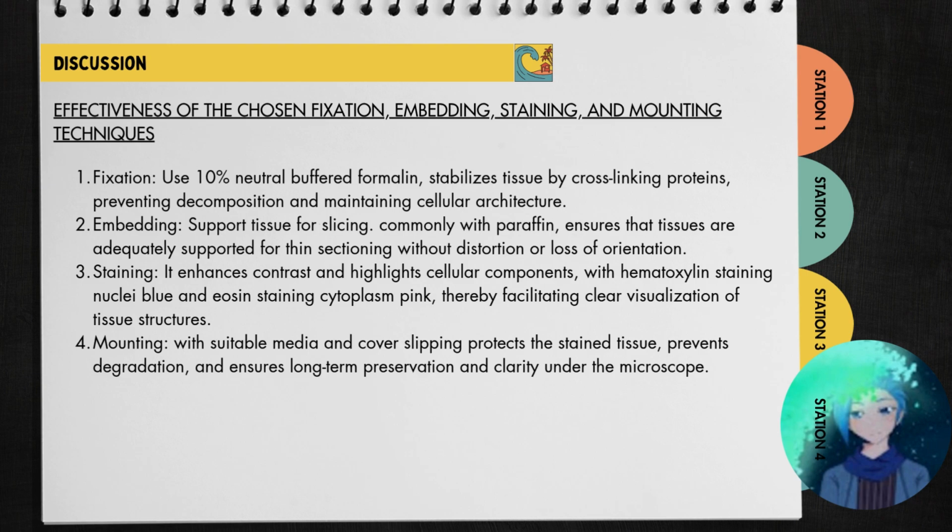Staining. It enhances contrast and highlights cellular components, with hematoxylin staining nuclei blue and eosin staining cytoplasm pink, therefore facilitating clear visualization of tissue structure. Mounting. With suitable media and cover slip, it protects the stained tissue, preventing degradation and ensuring long-term preservation and clarity under the microscope.